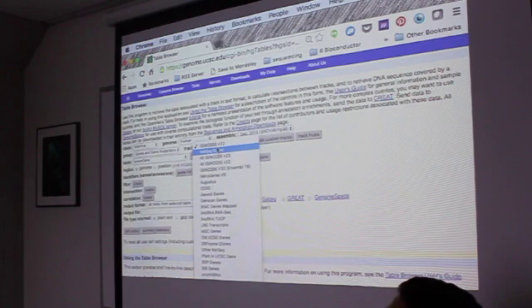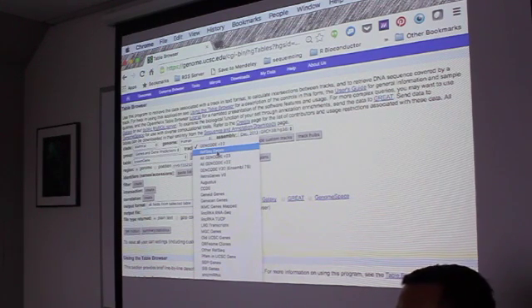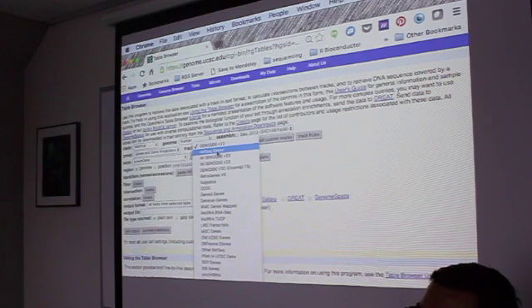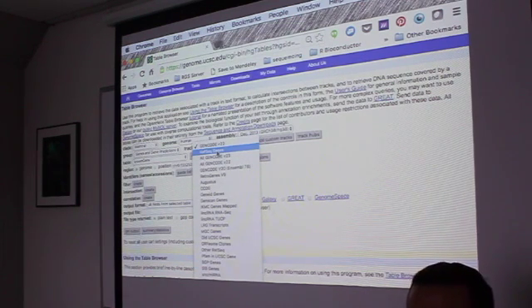It's basically, again, these are all different types of tracks. RefSeq is their own version of the genome tracks. They did their own genome assembly in one particular way, so these genes will be different. The IDs are different. UCSC also has their UCSC IDs. So that's part of bioinformatics, to know what your reference is.